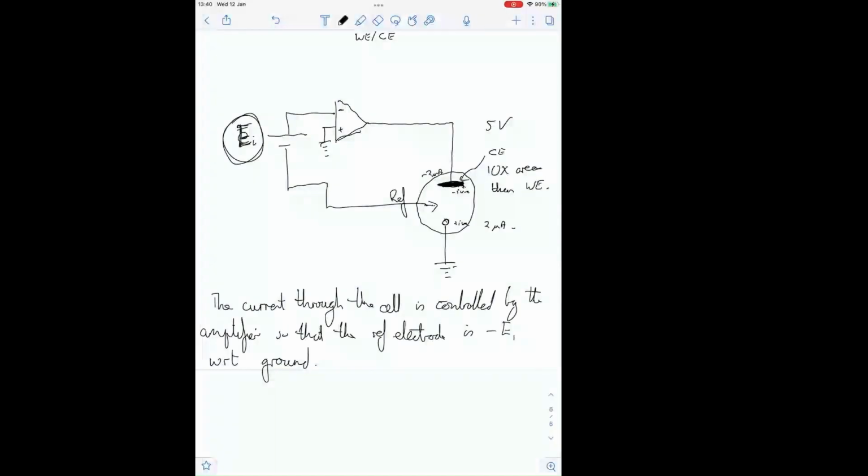I've ignored them because we typically ignore what's going on at the counter electrode. If I make this electrode a lot bigger, I might only go to 0.1 volt to get the same current, because current just scales with the area of the electrode. Now, I might not be doing those horrible reactions that are breaking down my solvent.